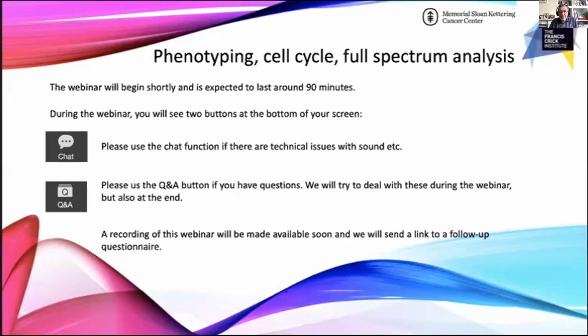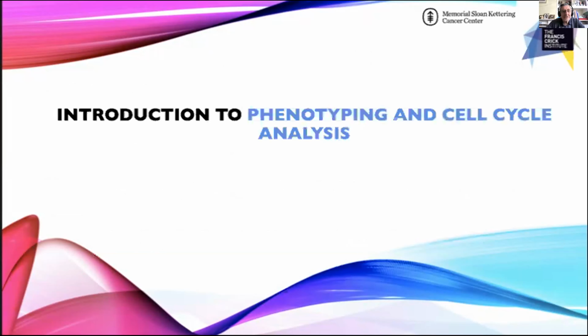Hello, good evening or good morning or good afternoon, and welcome back to our first OpenFlow session for a while. We've been away for a while, but we are now back. And today we're going to be looking at phenotyping together with cell cycle analysis.